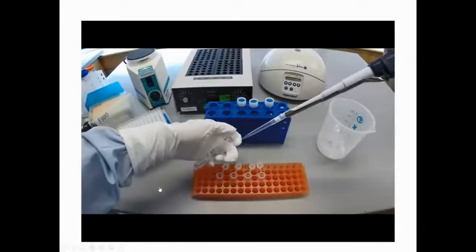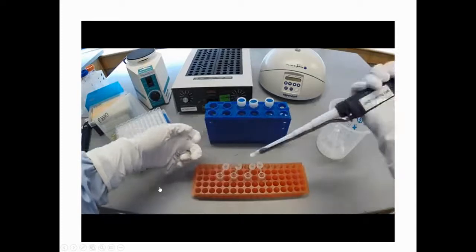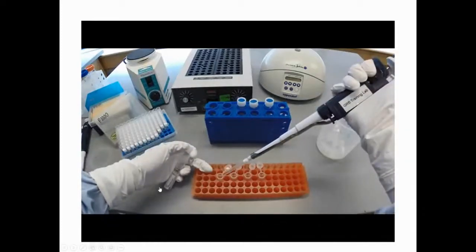When pipetting large volumes, draw up the solution slowly to avoid bubbles or contaminating the micropipetter. Have you all used the micropipette before? Very good.